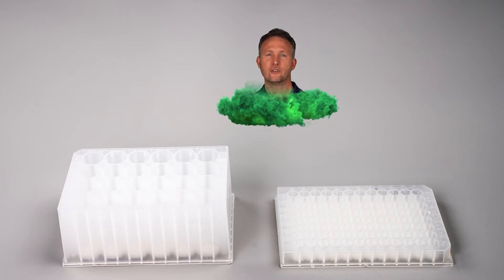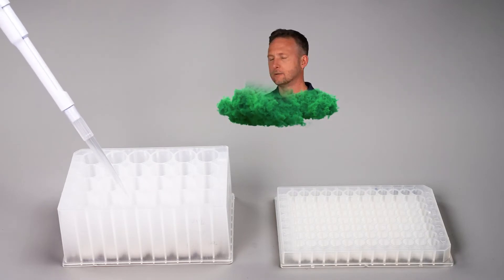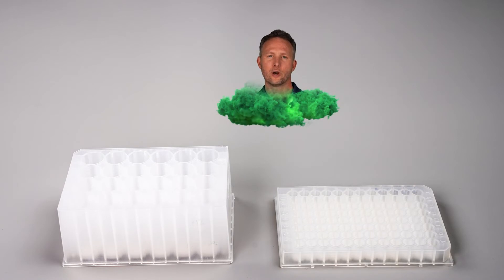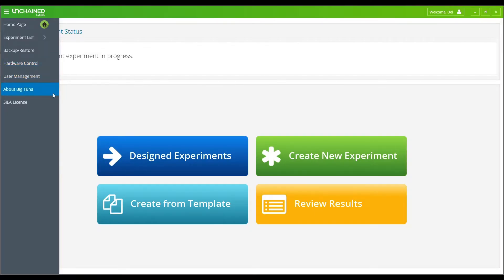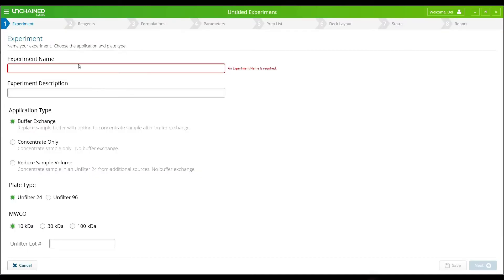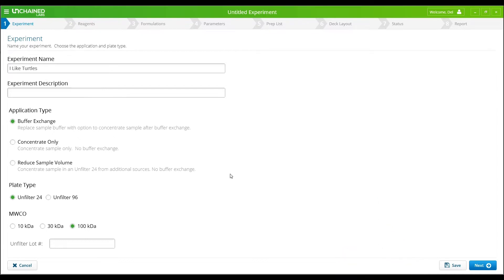Prepping the Unfilter is as easy as pre-wetting the membranes with buffer or DI water. While they sit, you can go set up your run in Big Tuna software in about the same amount of time. To set up a run, name your experiment and pick your Unfilter type. The Big Tuna software lets you select from three different applications to help you with your sample prep.